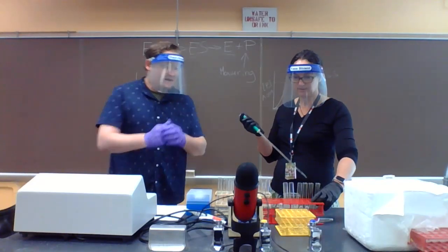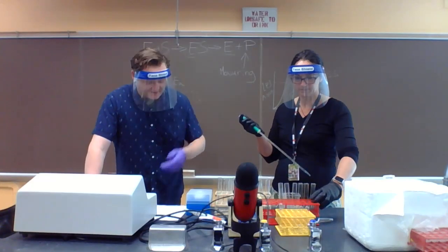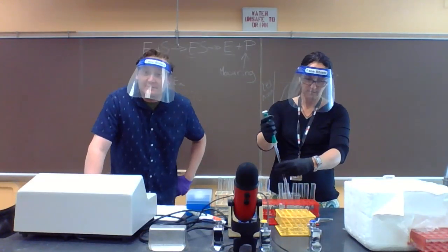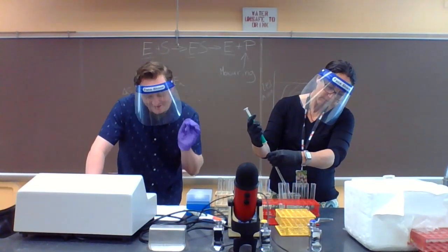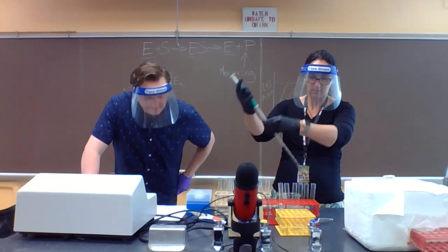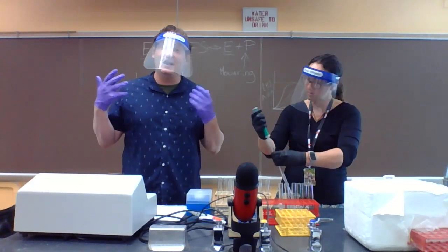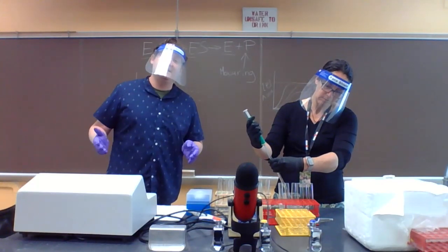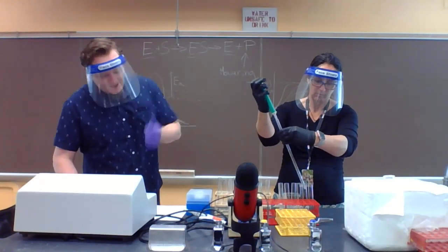Okay, so we have our boiled and unboiled enzyme, and now we are setting up our tubes as shown in your protocol under part 1. Every tube is going to have a total volume of 6,500 microliters. Volumes need to be constant. We need to have the same amount of total potato extract in each tube. But some are going to have boiled, which is inactivated enzyme, and some are going to have unboiled, which contains an active version of that enzyme.